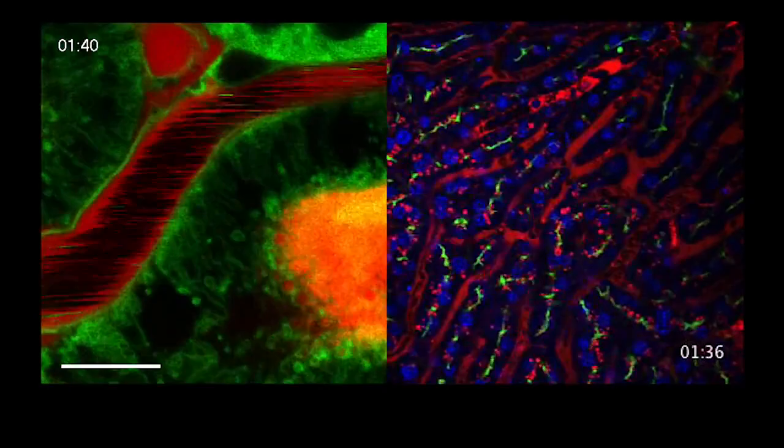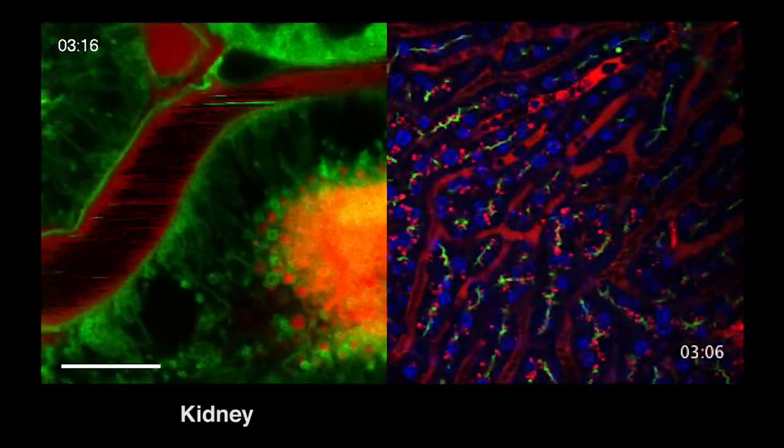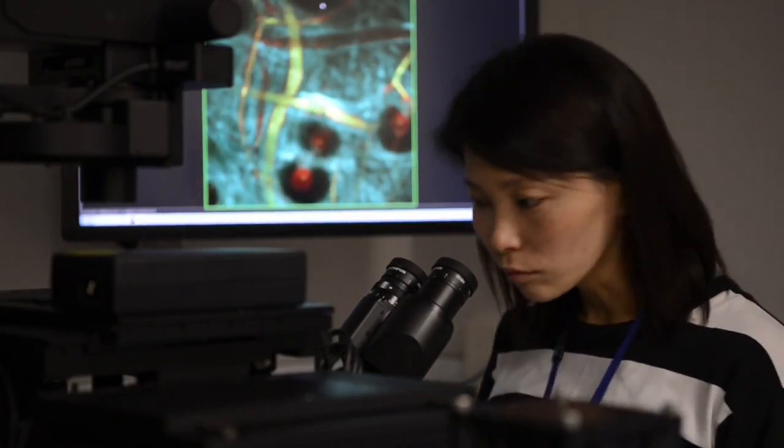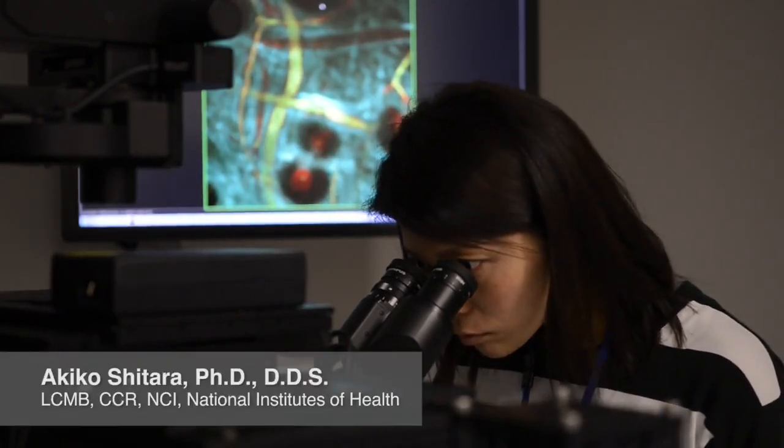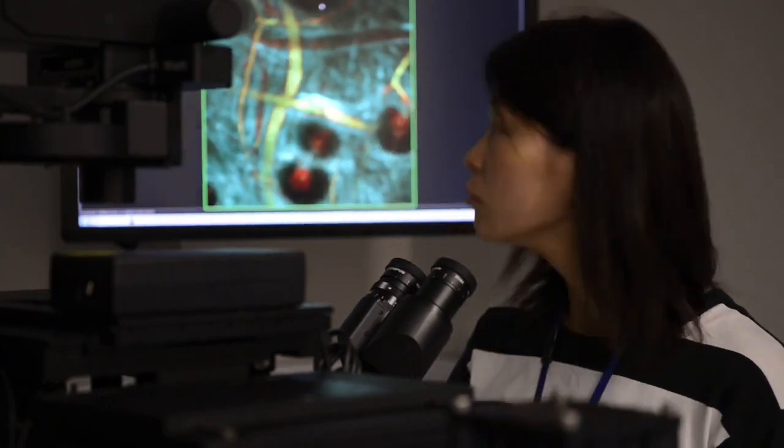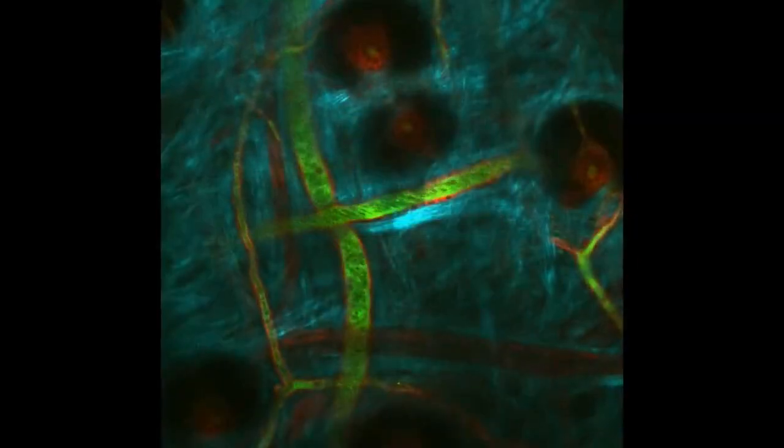These videos show the dynamics of endocytosis in the kidney and liver. It is like discovering a new world. Every day, we go to the microscope, and we have the opportunity to unravel new biology and ask new basic questions.